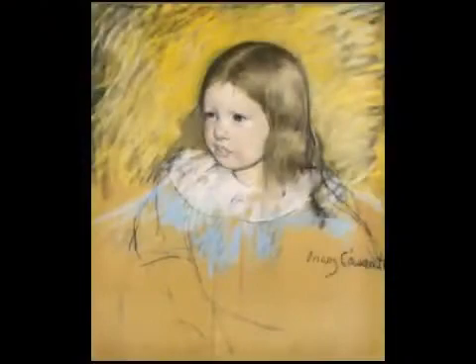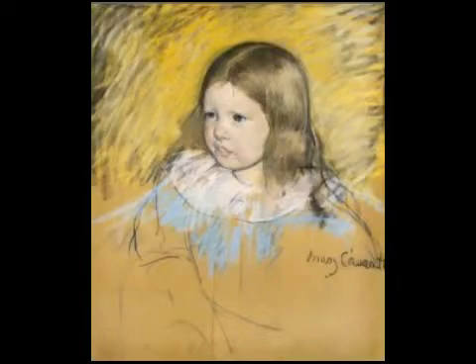And if you look at this image of Margaret Sloan, the Mary Cassatt image, what you see is a variety of colors, yellows in the upper portion of the image, facial tones, blues of the girl's dress, and so on. And one of the questions you can ask about that painting is, well, are those colors made from inorganic materials or organic materials? And surface-enhanced Raman scattering can tell you that information. So it turns out that this specialized version of Raman, surface-enhanced Raman, allows you to see the vibrational spectrum of all the colors that are organic in this painting.